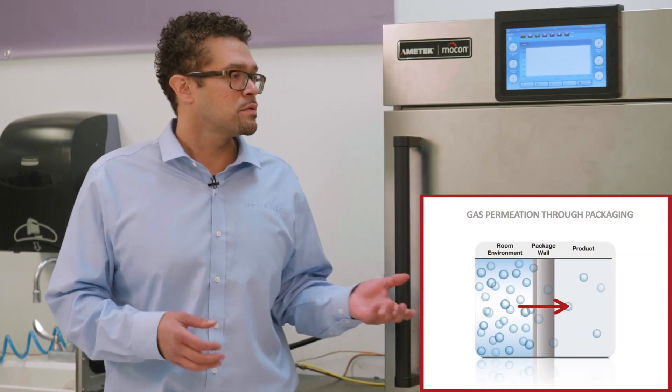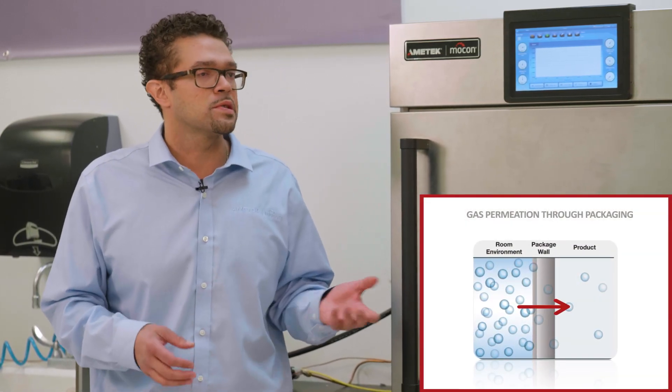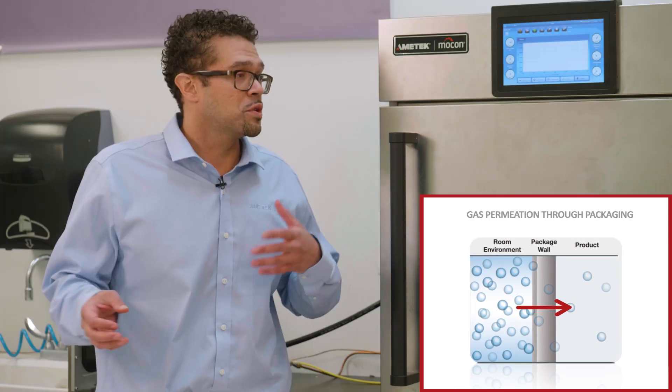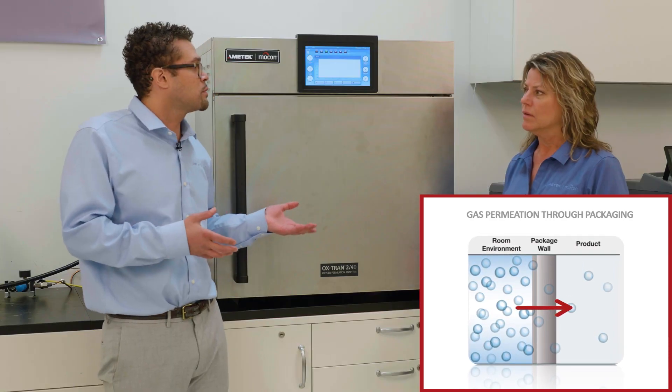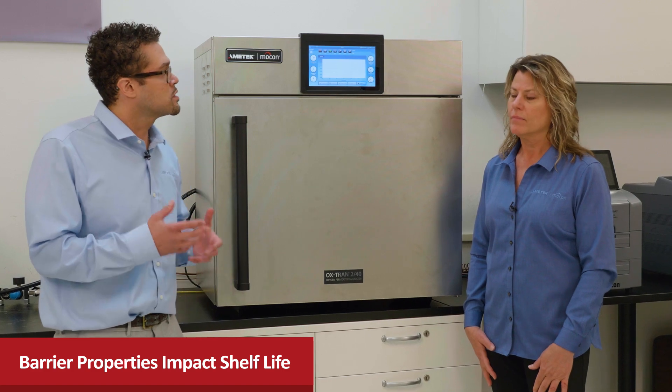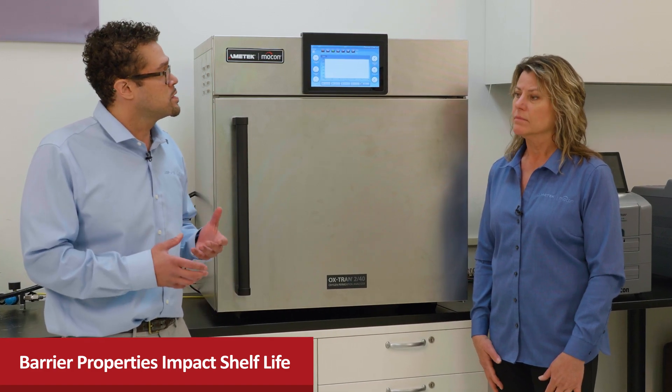Sure, just in a nutshell, permeation is simply the process by which some permeant is permeating through a solid material, which could be in this case a packaged sidewall. And it's really all dependent on what that material's diffusivity is, how fast that process is. So if we understand the barrier properties of our packaging, that allows us to properly calculate the product shelf life.